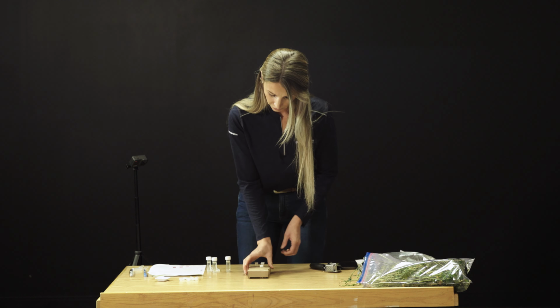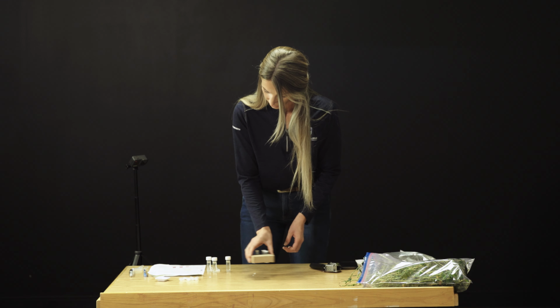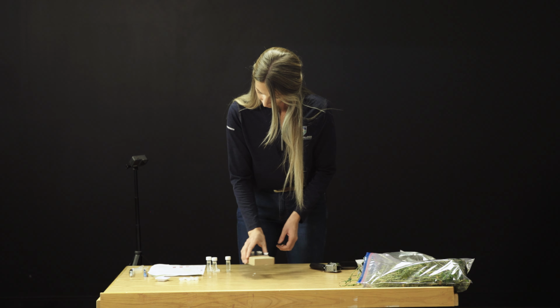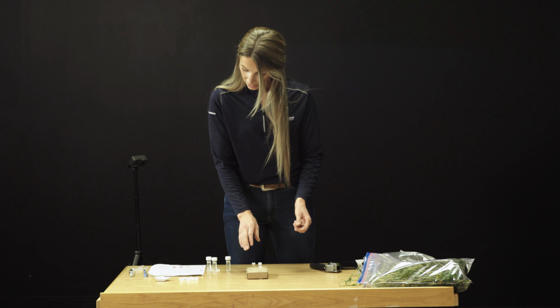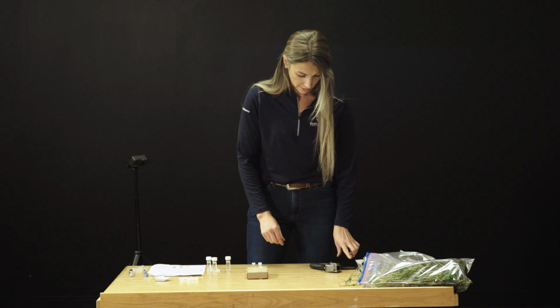Once you have recovered the cuvettes, you will then, again, gently mix them. We'll set them aside for 10 minutes, mixing gently every few minutes. So we'll set a timer for that.